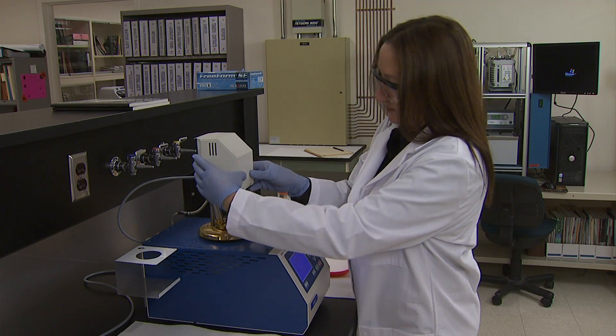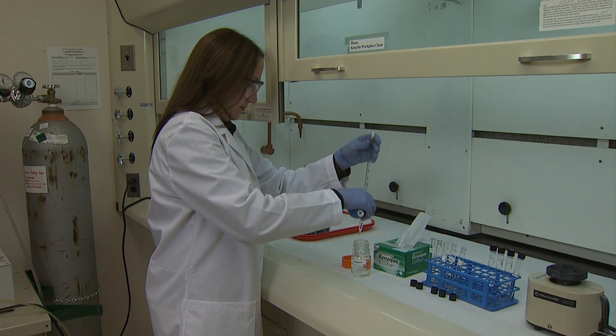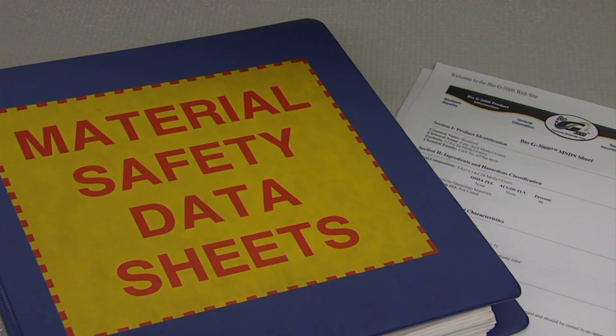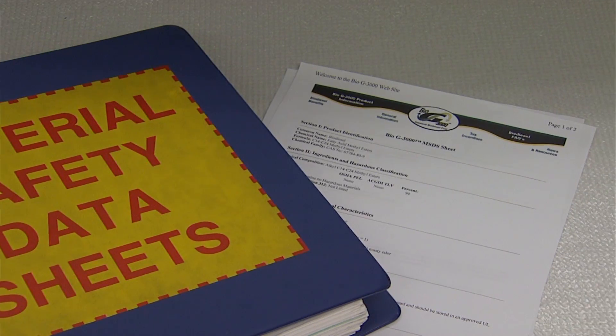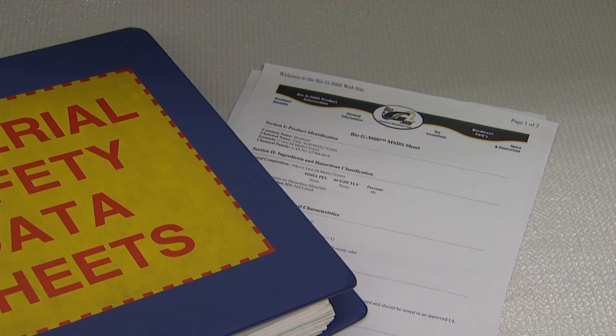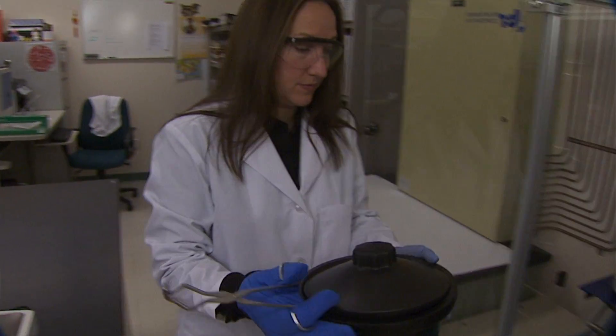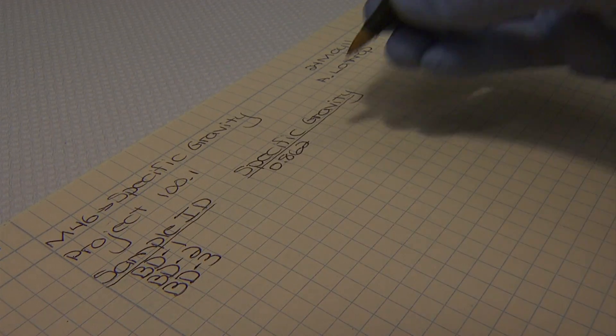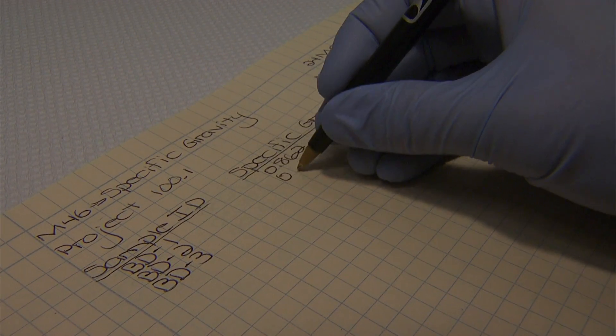Some of the recommended guidelines include follow safety precautions at all times. Consult the Material Safety Data Sheet for detailed information on the chemical substances related to the method. Wear the appropriate personal protective equipment for handling chemicals and instrumentation. Record data at the time of observation.